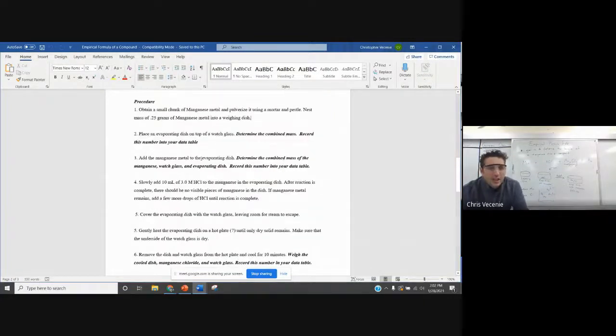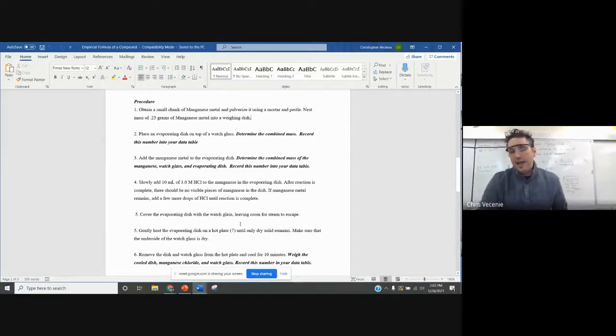All right. Then I'm going to initiate the reaction by adding 10 milliliters of the hydrochloric acid. It's going to start fizzing when that happens because we're creating hydrogen gas. And we're going to let that go until all of the manganese disappears, till it all gets chewed up. Then I'm going to immediately put it on a hot plate to evaporate the leftover stuff like I said. All right, then I'm going to show you how we generate some of our numbers. So let me take you to the back.